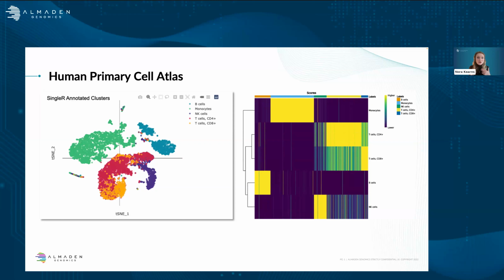You need to try some different filtering parameters. Maybe the first time you filtered your data wasn't the best. You need to go back and adjust some things. That's very normal in the processing of single cell data. And in fact, many people say that you should expect to spend about 80% of your time in single cell analysis in this space of trying a few different parameters out and getting to the point of what you as a biologist would expect to see in your data.